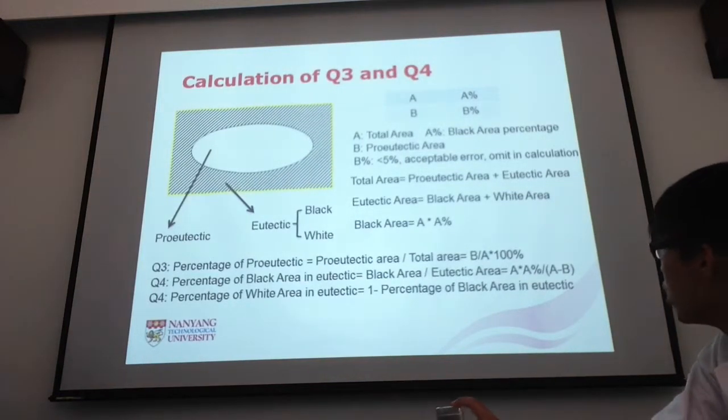Okay, if no question, you can do the experiment divided into 3 groups.